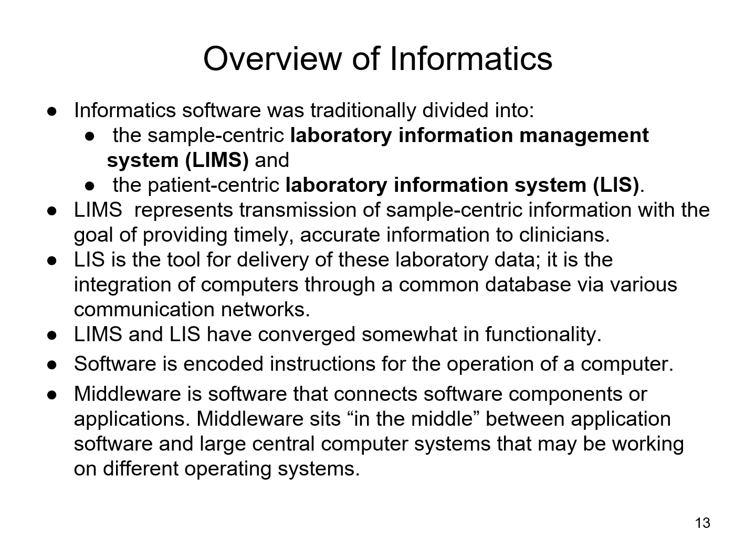So this is basically labeling it, ordering it, those things that center around the sample itself. Whereas your LIS is the laboratory data. So running the test, getting those results transmitted back to the patient's chart.